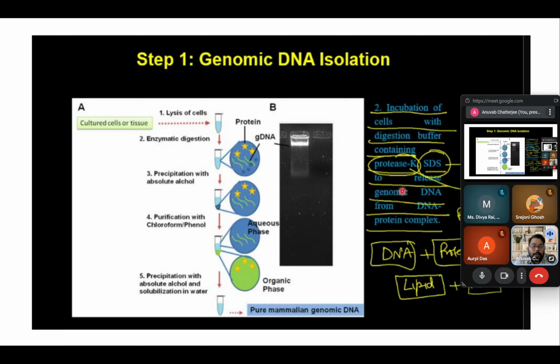So we have learned that histones and the histone complexes actually bind the DNA into the chromosomes. So if you want to extract the genomic DNA, most of the time you will get a lot of histones coming up as well because they are very tightly bound.